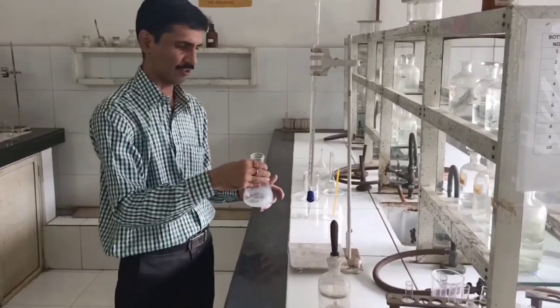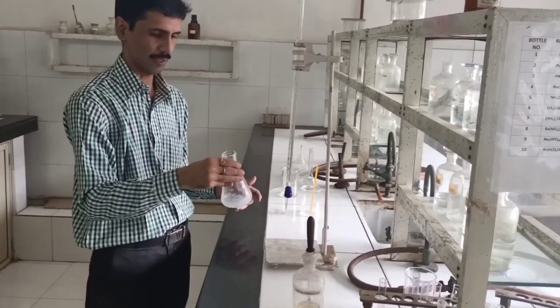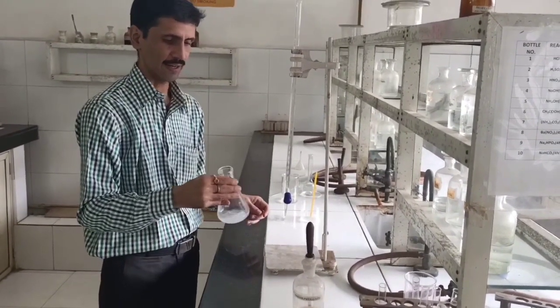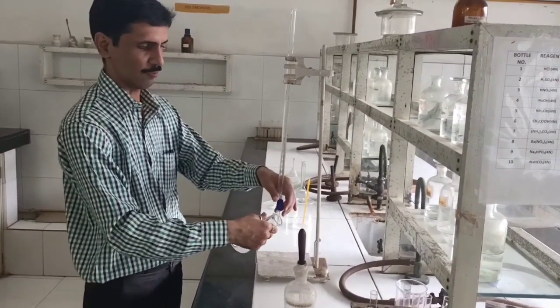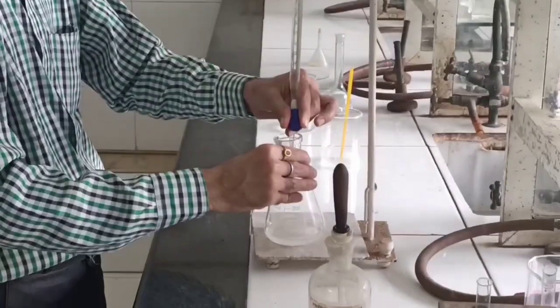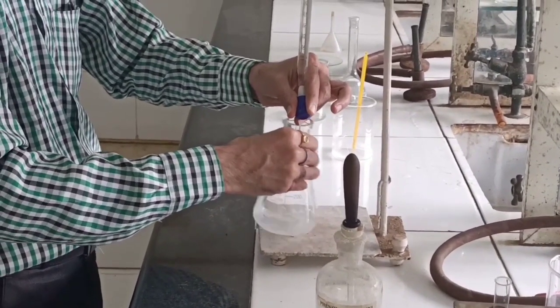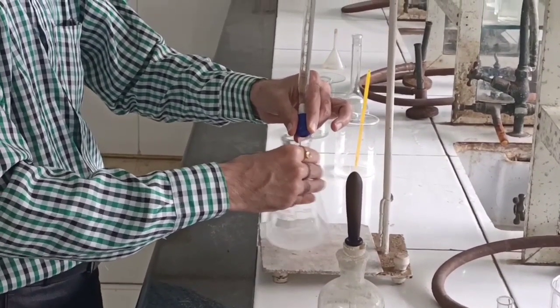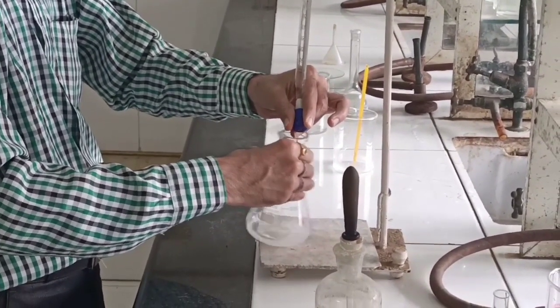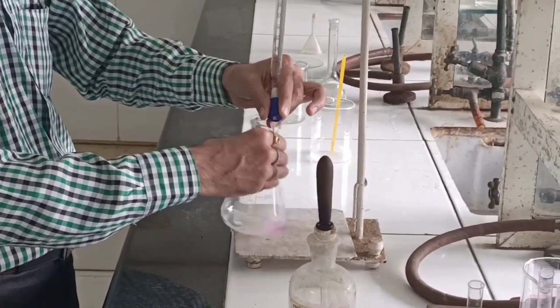Now, as I said, it's not going to be sensitive in the acidic medium, so it's going to remain colorless. Now, we start with the titration against NaOH. The color change, you know it very well, has to be from colorless to pink. Wait. So, we start. Drop by drop, we will be adding. Even after shaking, the pink color should sustain. That will be our correct reading.